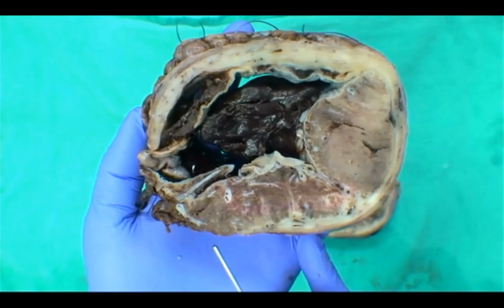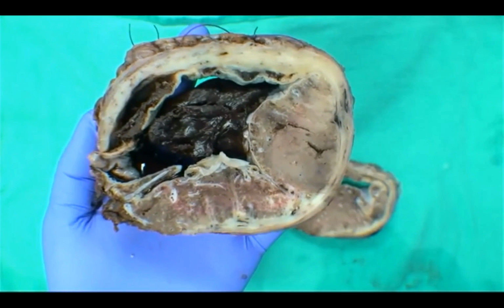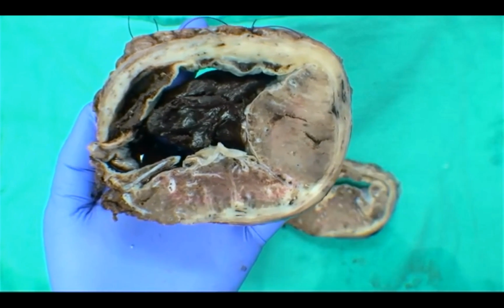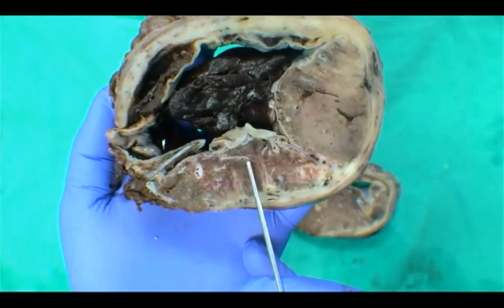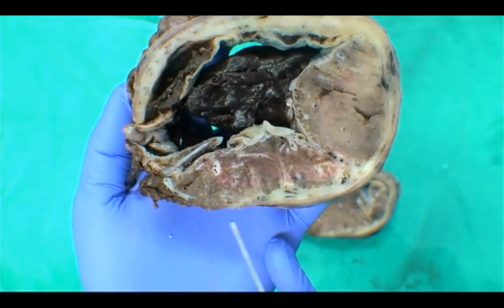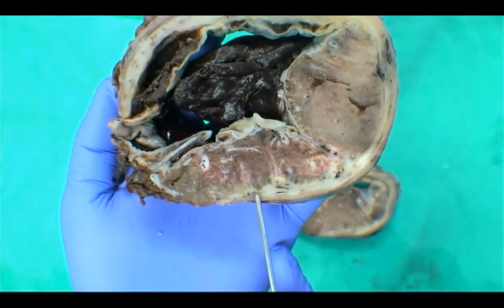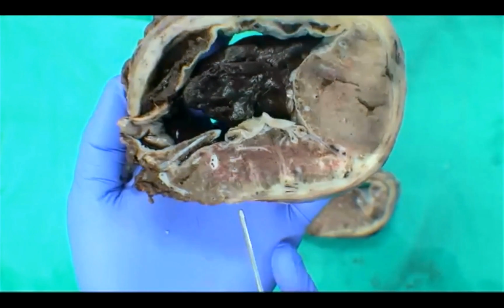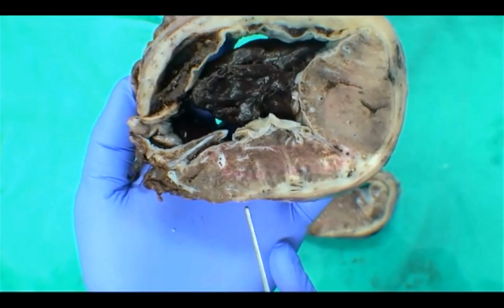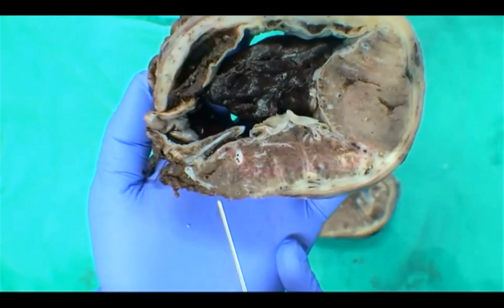Sometimes when you talk to PAs, we talk about the money section, the one section that defines and helps you stage the entire specimen. This is pretty much your money shot right here. If you take a section to document this, where you would have the placenta, a little bit of the myometrium left over, and then clearly the placenta going through and abutting the serosal surface, this would be a great section to take.